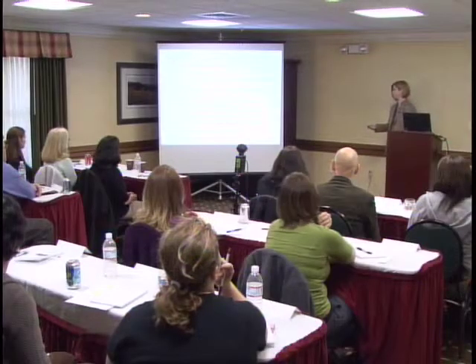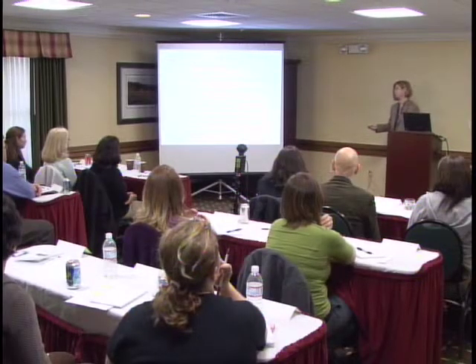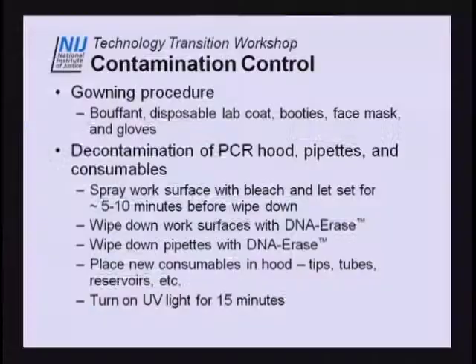Prior to you guys coming in, the people that work for me will decontaminate the PCR hoods, pipettes, and consumables. We do this in a two-step process. First, we spray the work surface with bleach and let it set for 5 to 10 minutes before wiping down. Then we also wipe down our work surfaces with DNA erase, and we wipe down all of our pipettes with DNA erase as well. Then we'll place any new consumables we want to use, such as tips, tubes, or reservoirs, and turn on the UV light for 15 minutes and treat everything that's in that hood for 15 minutes.